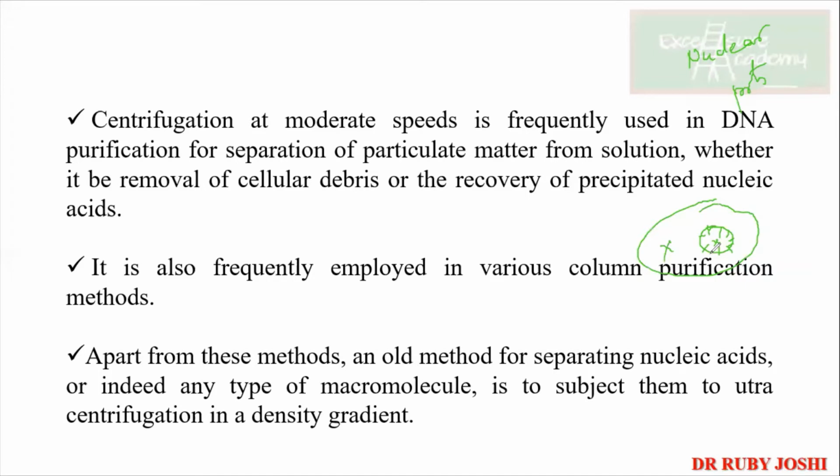Yes, ma'am. So what is the best method? That I go for the nucleus purification. This is one example where you can use gradient centrifugation. So I'll go for nucleus purification.